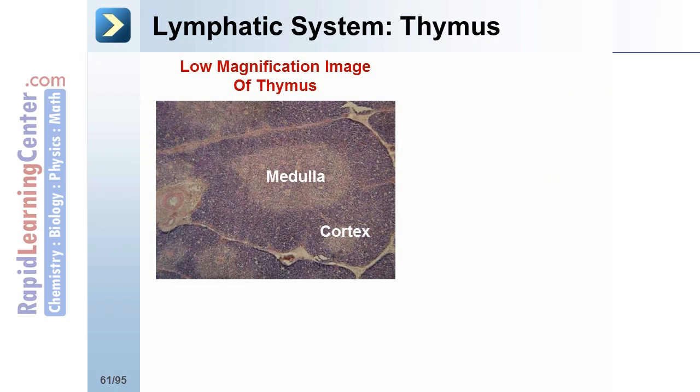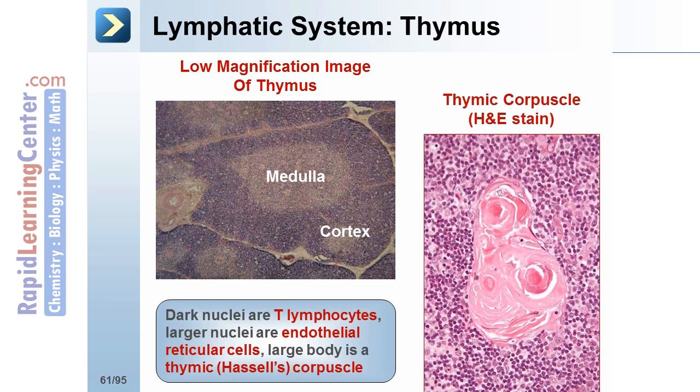There are a number of different histological stains used for light microscopy. Perhaps the most commonly used stain is hematoxylin and eosin, abbreviated H and E, which is good for visualizing general structure. Hematoxylin is basophilic, staining nuclei blue. Eosin is acidophilic, staining the cytoplasm pink.